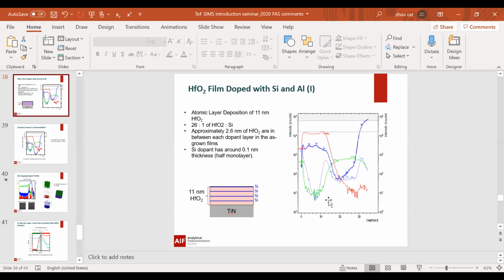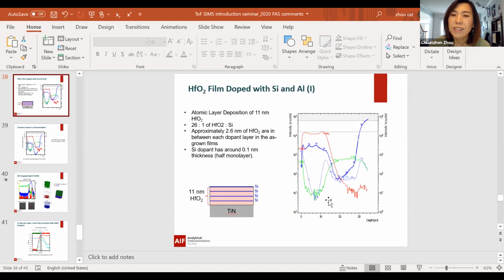Yeah, unfortunately, my almost 20-year-old cesium gun is limited to about 3 kV. You'd be able to do 2, but now I can't keep a stable beam below 3. I see. Yeah, that's true. It's hard to maintain stability using low energy. The current is pretty low too. But what I haven't been doing recently is trying the higher energy, which I think I'm going to try when I can get back into the lab. Yeah. Okay.